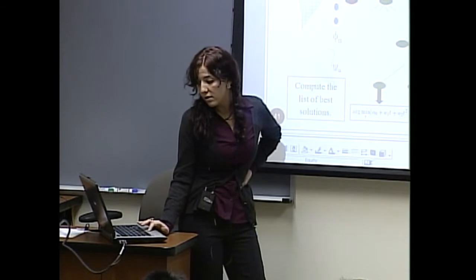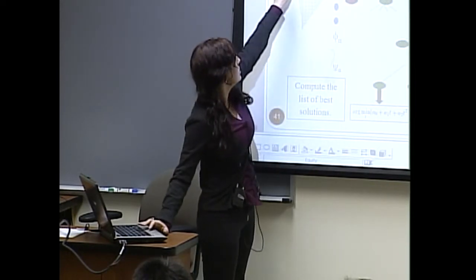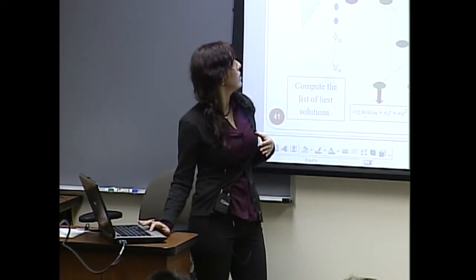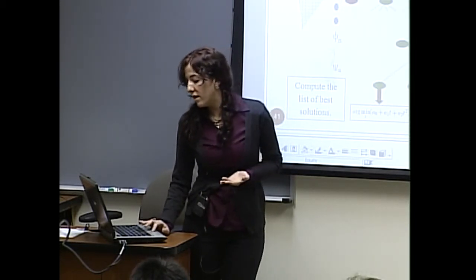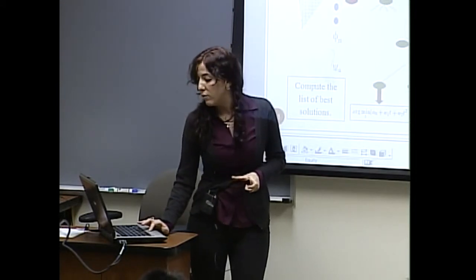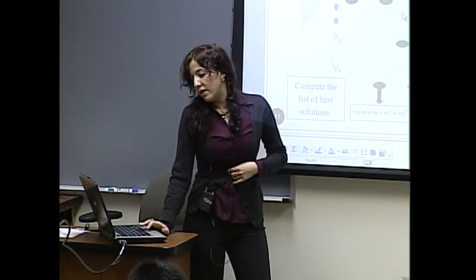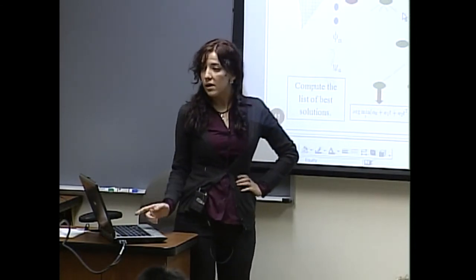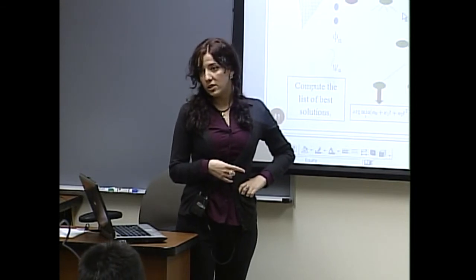In my case, since it's overconstrained, we cannot just solve each equation because we have additional equations. Solving each equation would be like finding an intersection of two ellipses. However, we have a third ellipse which corresponds to the new alignment medium that we obtained measurements in. Therefore, instead, we minimize the least squares term, which is also a function of one variable only, and we can do it in each iteration of the tree construction. Therefore, the argument is that if the system was perfect and the data did not have any errors, we would in this way find all of the solutions, because the minimization would be equivalent to finding solutions to the equations.